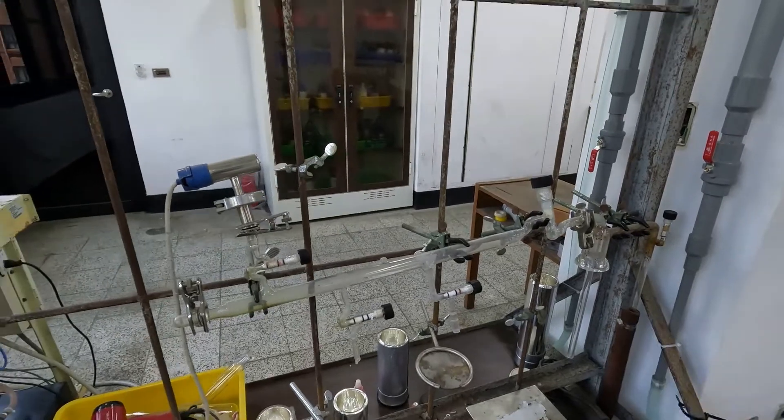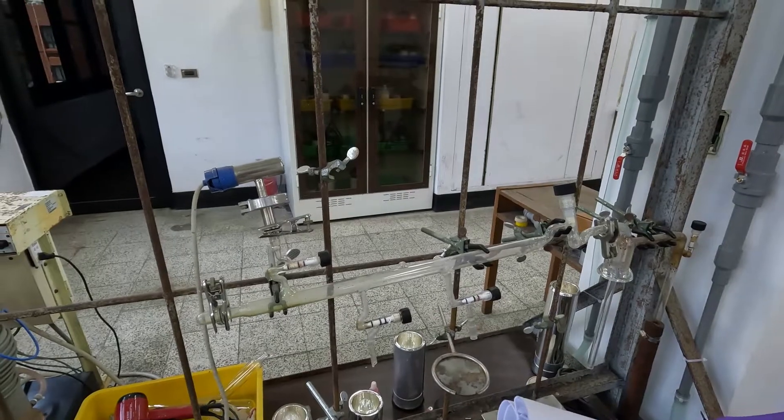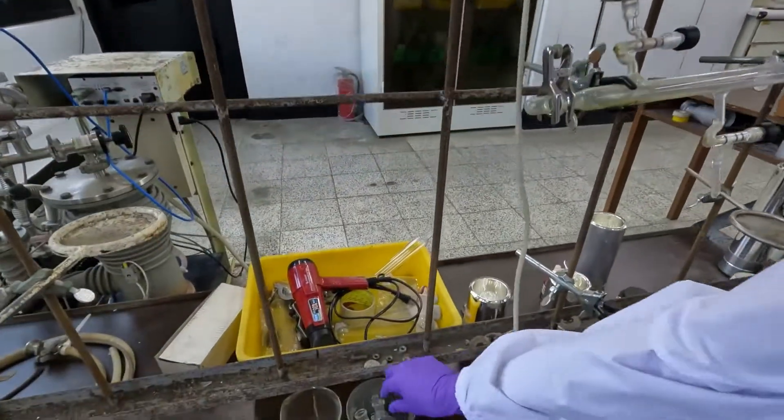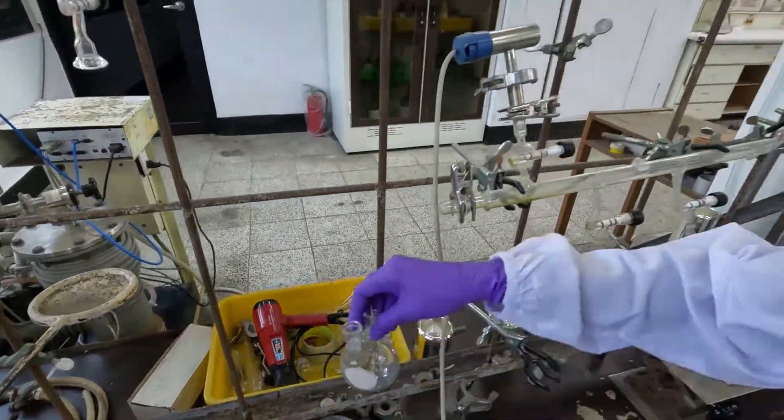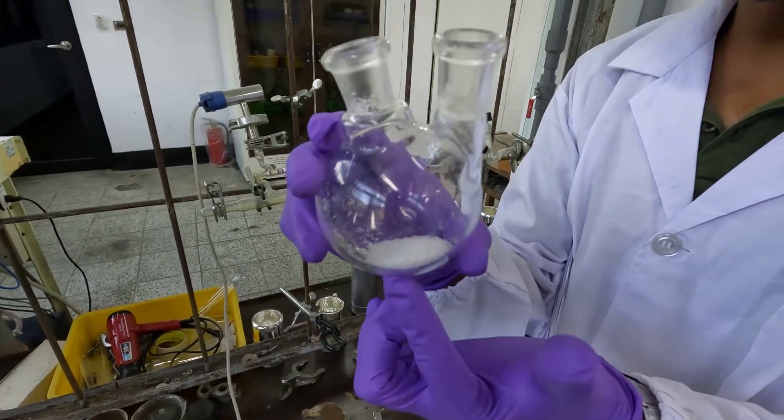In this experiment, the first step is you have to measure 5 grams of sodium chloride into a double neck bottle. You can see it — this is sodium chloride, 5 grams.